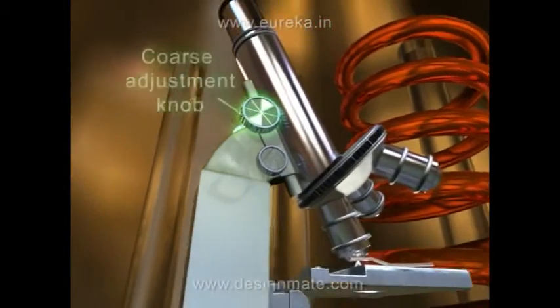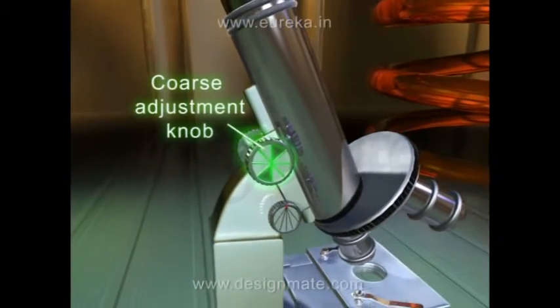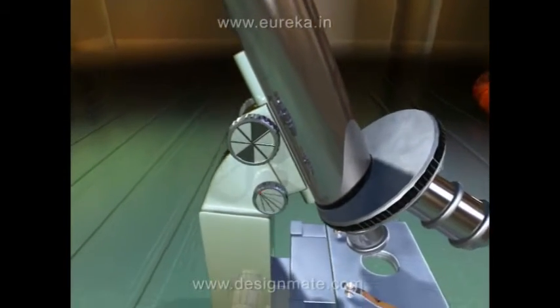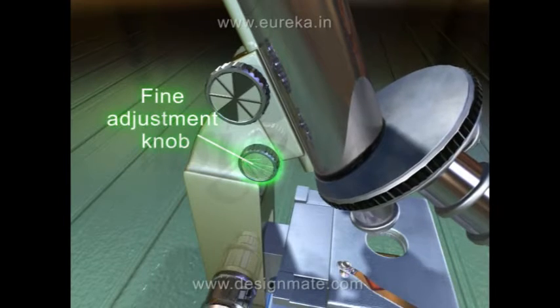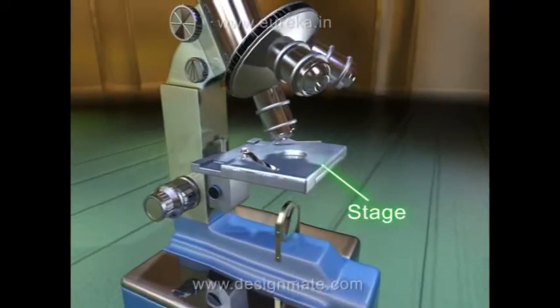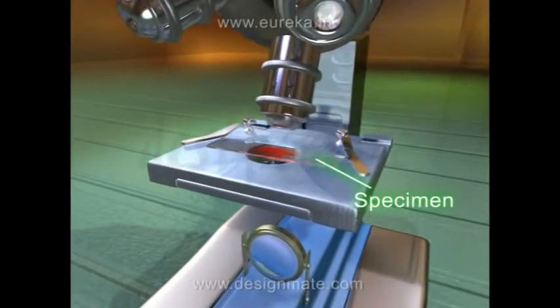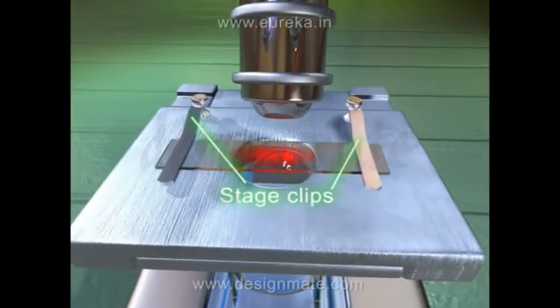Then we have the coarse adjustment knob, which is a large round knob on the side of the microscope and is used for focusing the specimen. Adjacently, we have the fine adjustment knob, which is a small round knob on the side. Next, we have the stage, which is a large flat area under the objectives on which we keep the specimen. Stage clips are used to hold the slide in place.